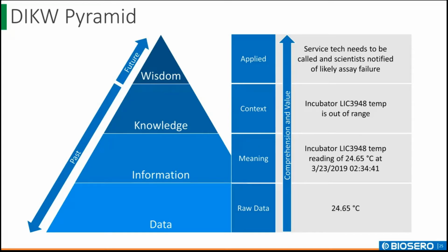As a side note, one of the problems that I see is that often there's a lot more investment into the AI/ML side of data processing, the analytics, and not enough is invested in the hard work of capturing and properly contextualizing that data. Right, the analytics is focused really just on the experimental and sample data, and doesn't take into account the context, because really most companies haven't captured that data properly.